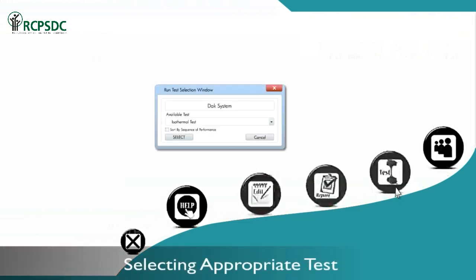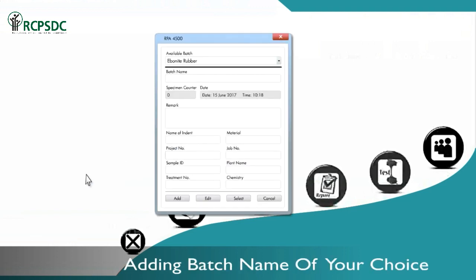Select the test you wish to carry out. Fill in the compound details to ensure traceability of compound with the test report.